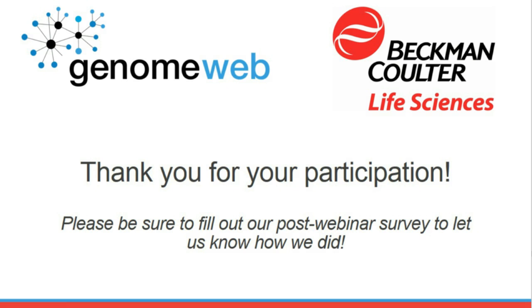But one part is really important. We can at least have a uniform type of missing data. Sometimes it can happen that some samples are 100% missing because of the DNA, the process, everything, and manual pipetting can contribute to this.